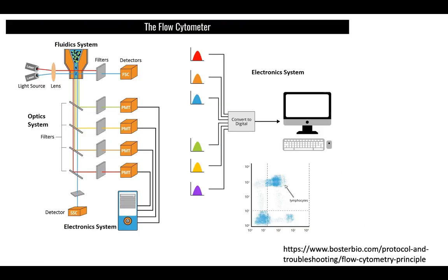So the basic idea of the flow cytometer is that the cells here would travel through the fluidic channel or a filament or a tube, and each of these cells have been labeled accordingly with different colors.